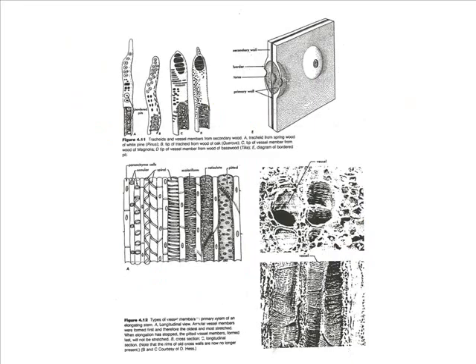We also have this picture from your handout. The bottom two-thirds of this is all vessels, vessels that were formed at different stages. Early vessels formed very early, sometimes continue to stretch a bit, and the secondary cell wall pulls apart, making them look like slinkies. Here are some scanning electron microscope pictures. Vessels cut across. Here's the long way. Big open pipes.